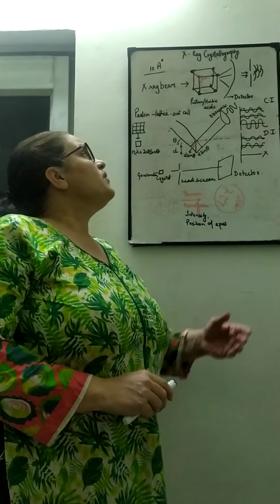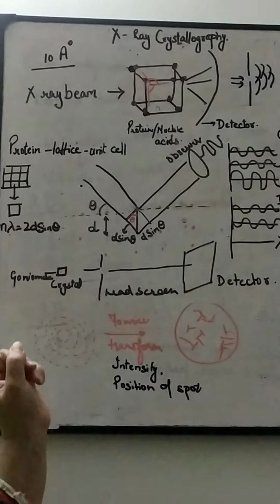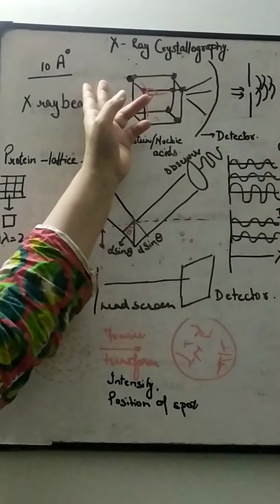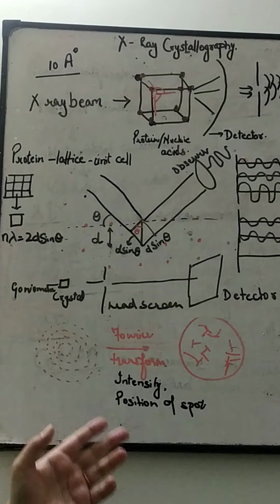Hello everyone, today we will be talking about X-ray crystallography. X-ray crystallography, as the name suggests, is the study of the crystal structure with the help of X-rays. Now why are X-rays used for studying the crystal structure?